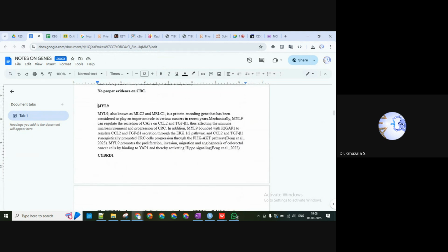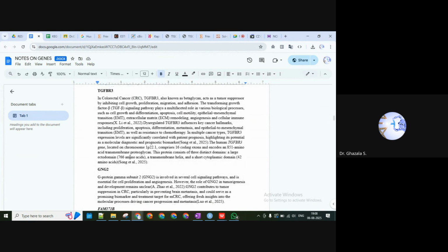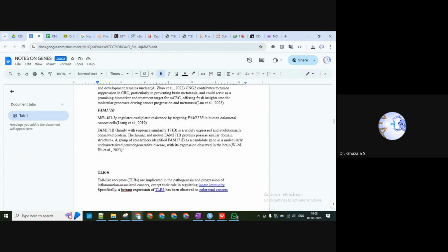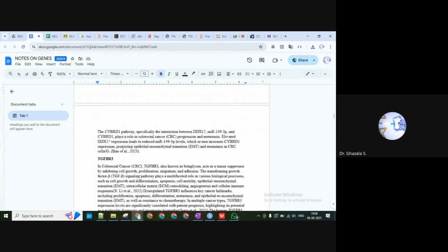We will see later, but right now we are intending to see that today the session is about tumor microenvironment, right? So for that we are looking for the different tumor-related cell types where your genes are most activated.